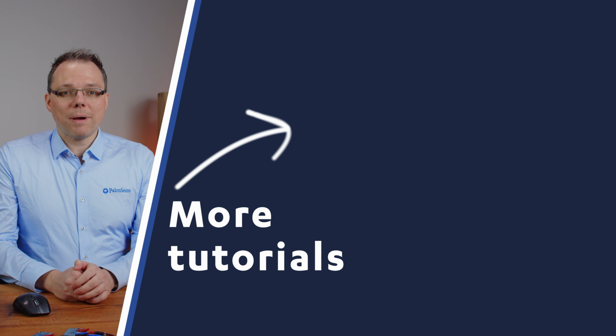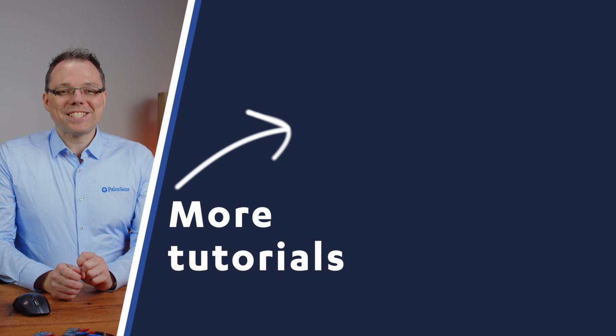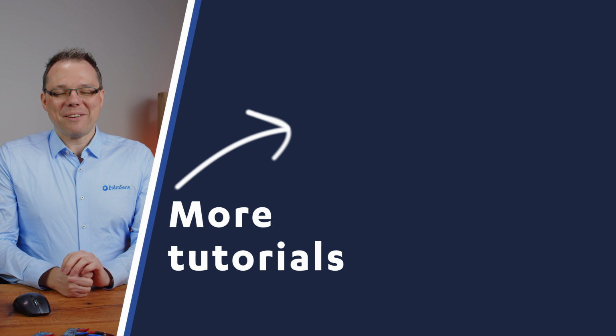This is all that I want to tell you for the introduction of the individual mode. If you're curious about the simultaneous mode, we made a video for that. Just click on that to have a look at it.